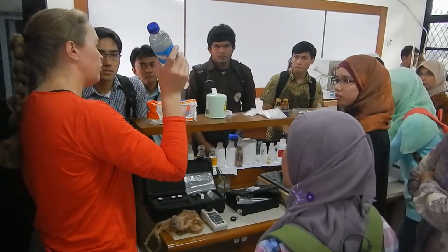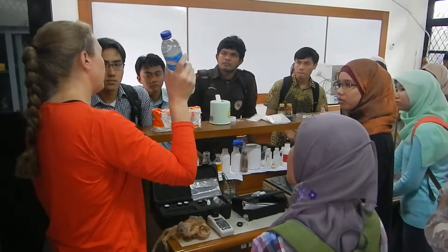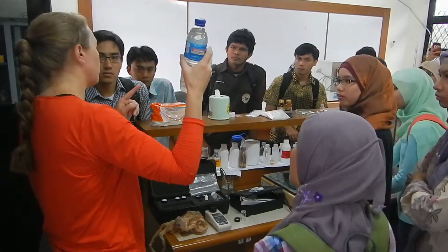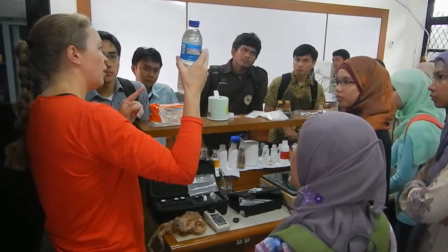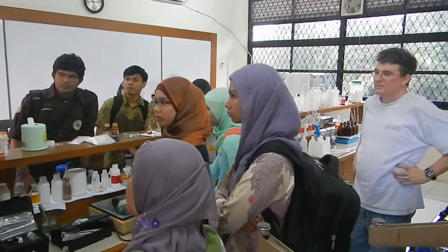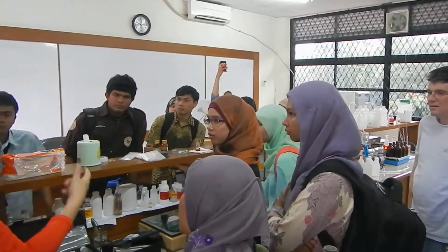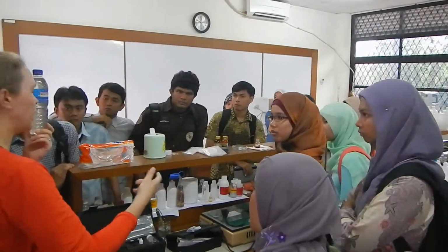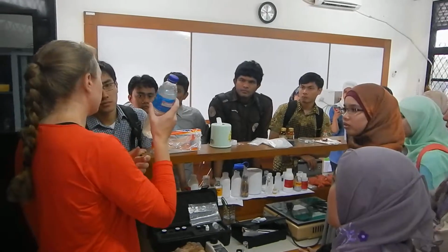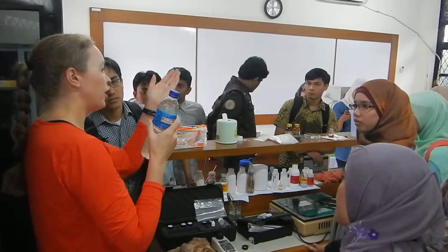One of the nice things that you can do, though, is there's usually a really good relationship between turbidity and total suspended solids. So if you take enough TSS samples and turbidity at the same time, you can develop a regression equation for that. It's much like the rating curve between stage and discharge. Exactly. And so then what happens is I can put a turbidity sensor in my stream and take point measurements every 5, 10, 15 minutes, whatever I want. I just need to calibrate that every couple of weeks. Now I can monitor this and infer what TSS is for a very long duration.